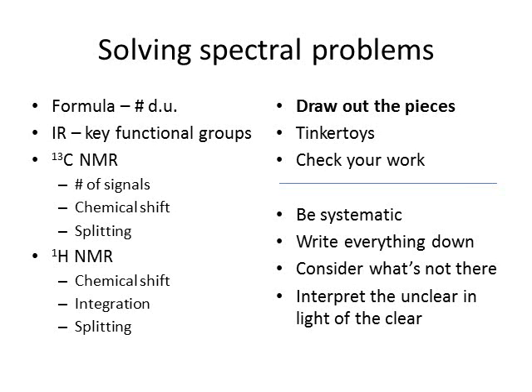First thing I do is I count the signals. I just simply say, oh, there's 6 carbons in the formula, there's 6 lines in the spectrum, I have no symmetry. Or there's 6 carbons in the formula, but there's only 4 lines in the spectrum, so there must be some sort of symmetry.